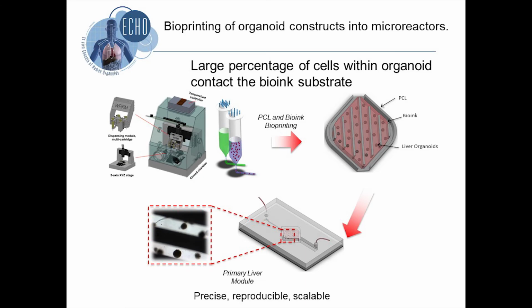Most of the tissue organoids that we use or have developed are spheroids, and they're largely internally supported by some of the strategies we've used to fabricate the organoids, and we'll be talking about that actually at 4:15 today. But a large percentage of the cells in the tissue organoid are actually on the surface of the organoid, and we've designed bioinks that are supportive of those cells that aren't completely surrounded by their neighboring cells. So that's the thought behind why we put effort into customizing the bioinks.